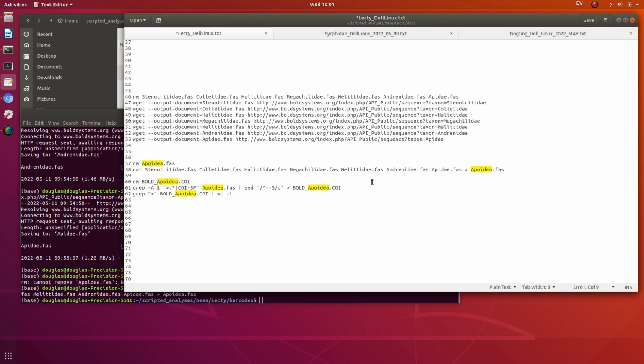So this is a grep which scans any file, and we're looking for a FASTA delimiter, which is the forward arrow, and the marker string COI-5P in the ID. That's when we know. Now this is a silly little thing we need to add on. I'm not sure why this happens. We'll get an extra couple of dashes added somewhere. I don't know the reason for this.